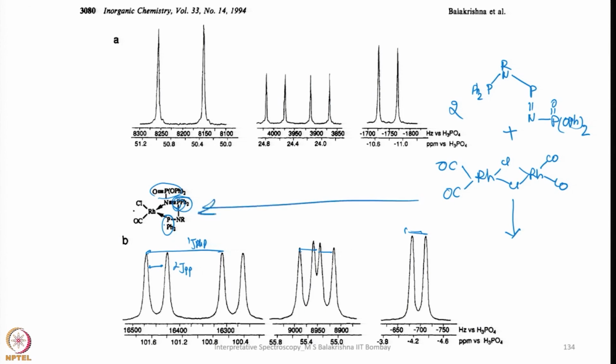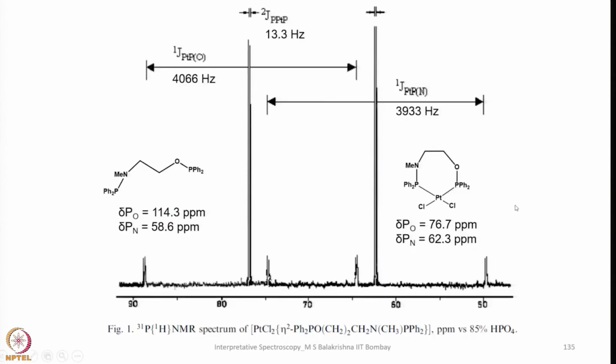Yes, now we can conclude that this bond is broken and a mono rhodium compound is formed in this case.